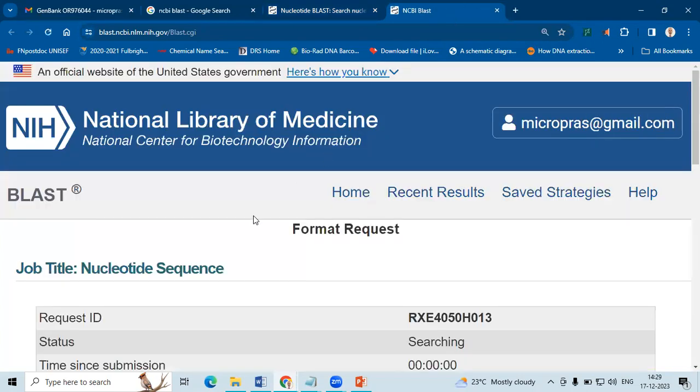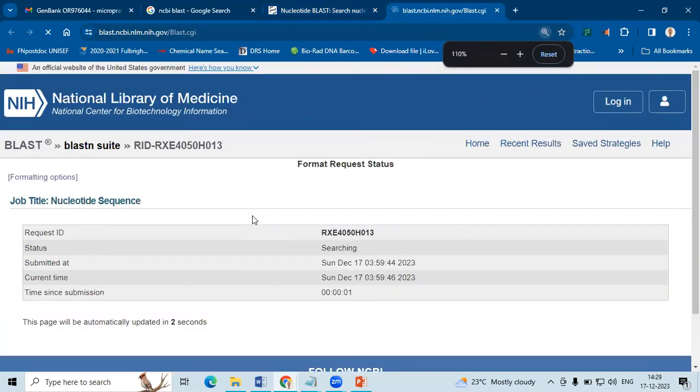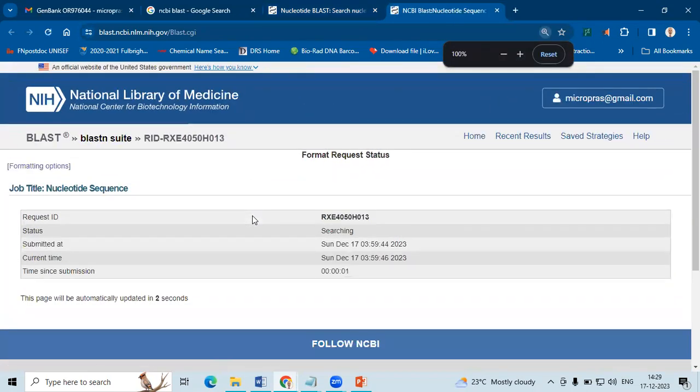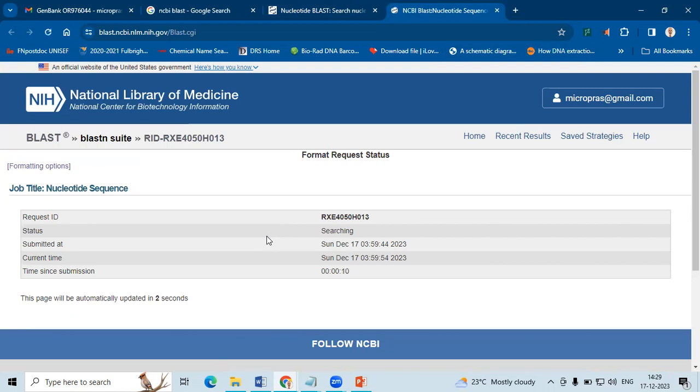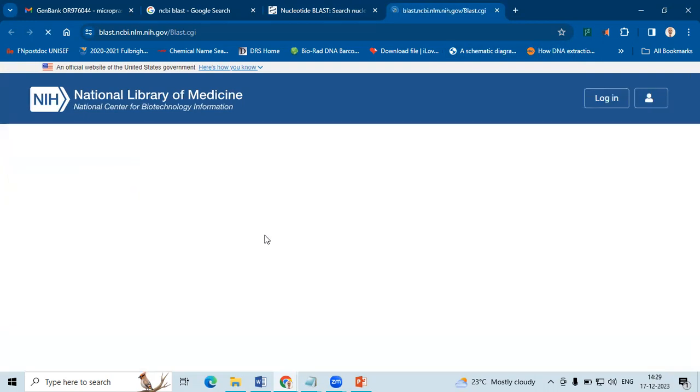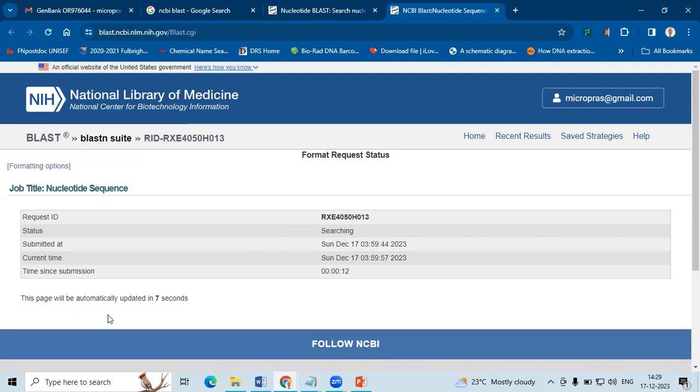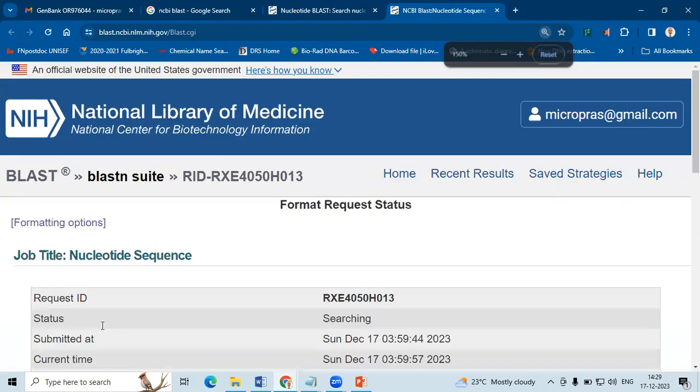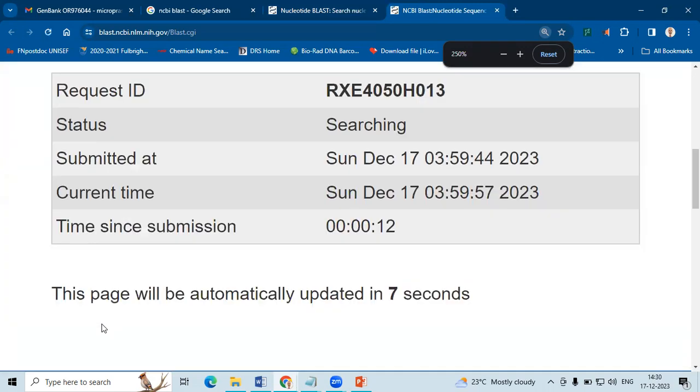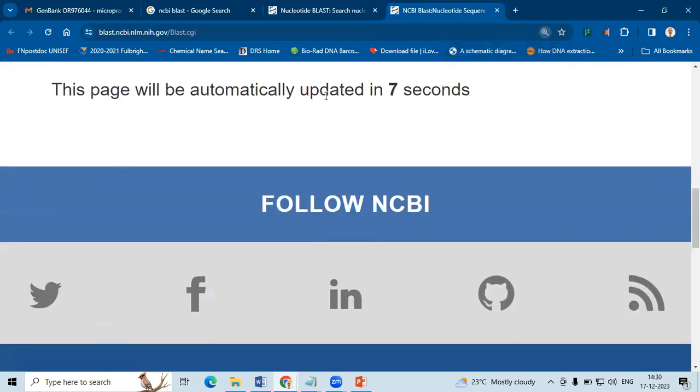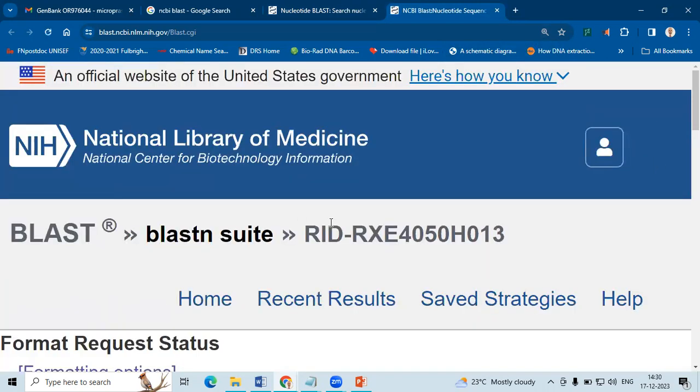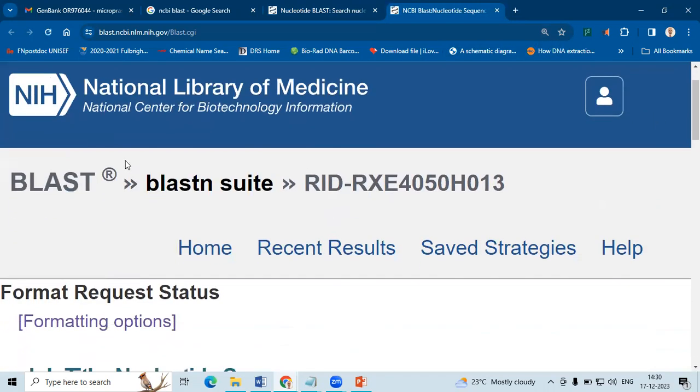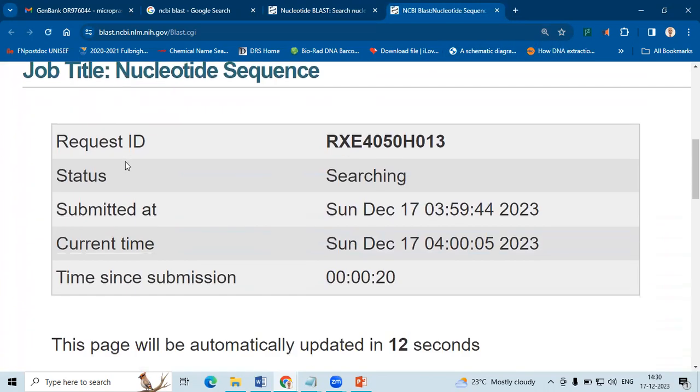What happens? A new window has been created. So basically what's happening here is your sequence is being compared with the database sequences. And whichever is the closest match, that sequence is formed, it will be displayed. As you can see here, at the bottom page will be automatically updated in seven seconds. This will be keep on running, every seven seconds the page will be updated.